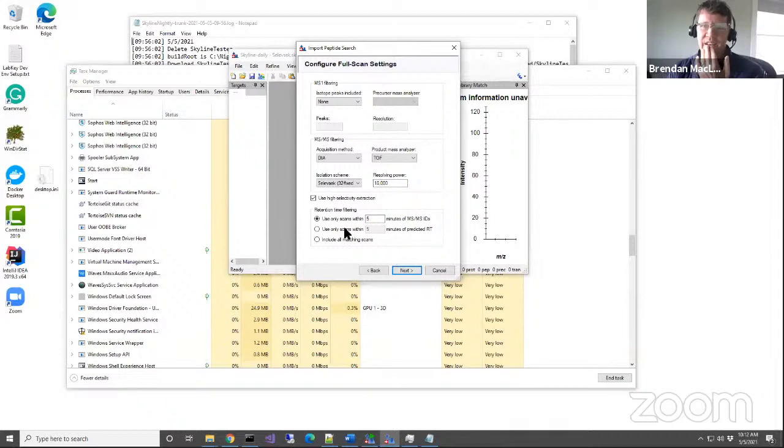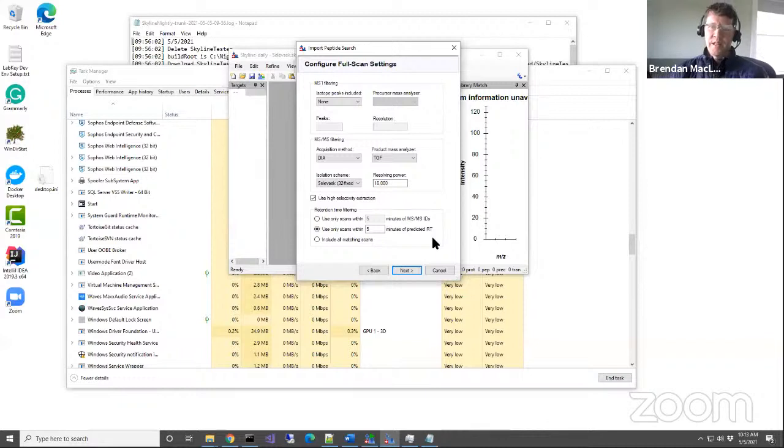All right, and then the last thing you need to do is this. If I were going to do MS1, which we're not doing in this experiment, it makes things bigger and a little bit slower, and so I'm trying to get through these things fairly large scale, but also make them pretty teachable.